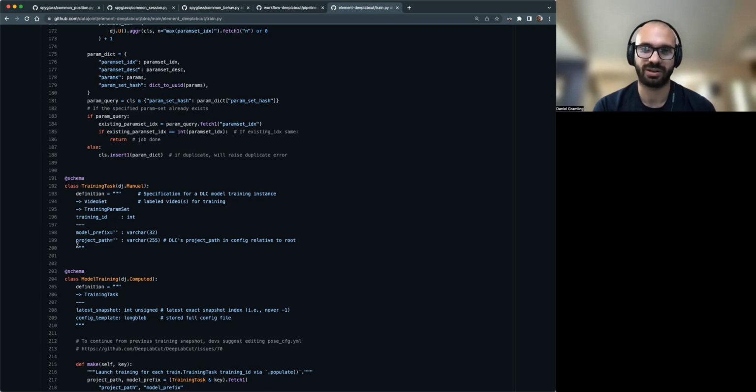Yeah, I definitely get how that might be easier. But that also means that you have to make sure that you're using a unique training ID every time, or a unique video set and training param set, right? Like you could reuse a training ID if your video set is different. Yeah, there's no protection against that. You could be working on one video set, one training param set, training ID 1, then a new video set, same param set, training ID 1. There's no protection against that.